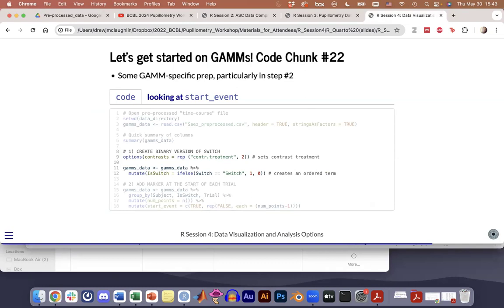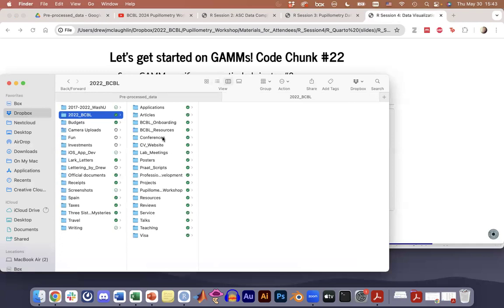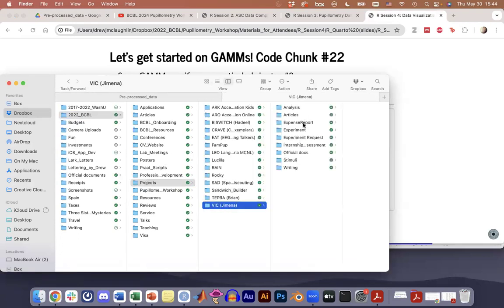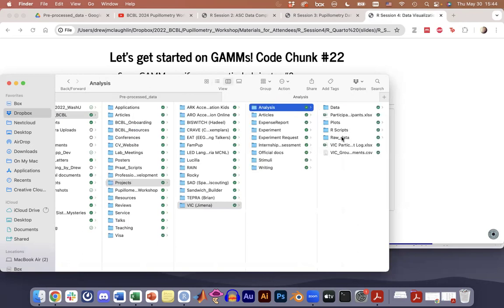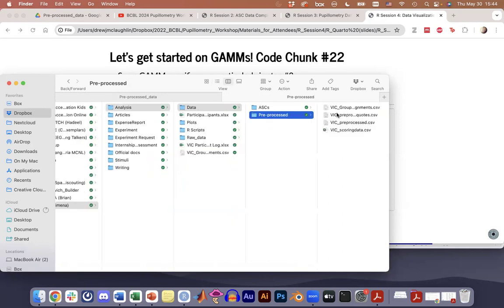And you know what? This actually rings a bell because Jimena has a PC and I had to reprocess the data for her at one point. Actually, do I have a version of the reprocessed data? I'll look it up in just a sec. Oh, wait, it says something, warning there. But it's a warning, I don't think it's that.